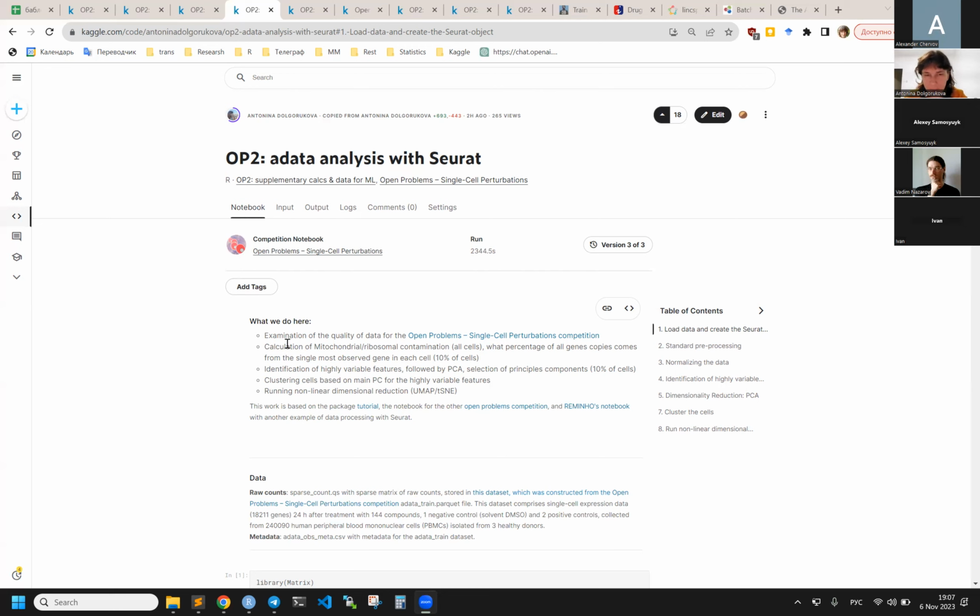In this competition, we have to work mostly with aggregated data, not single cell, but as an additional data set, we also have some single cell data. So it may be useful to get some knowledge on how it looks and what we can find there.